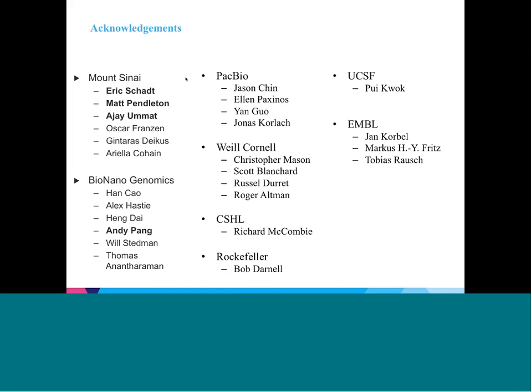Anybody want to comment? This is Han, Chief Scientific Officer at BioNano. I want to make one simple comment. In cancer, there's a lot of heterogeneity, and pay attention, these two methods actually are single molecule platforms. So that's a very unique combination as well.